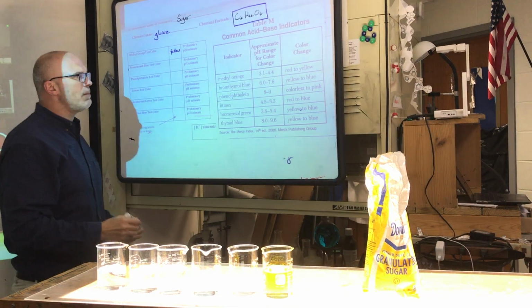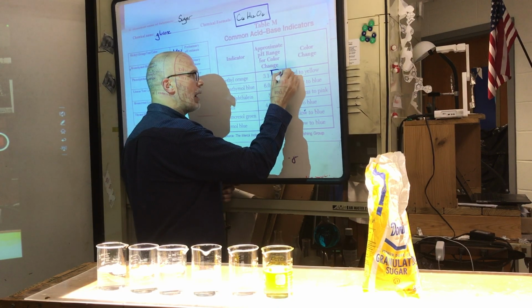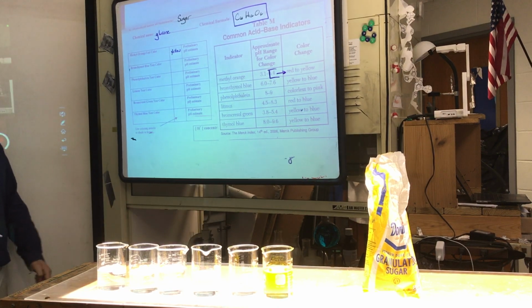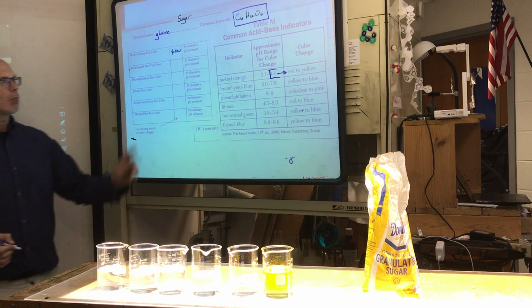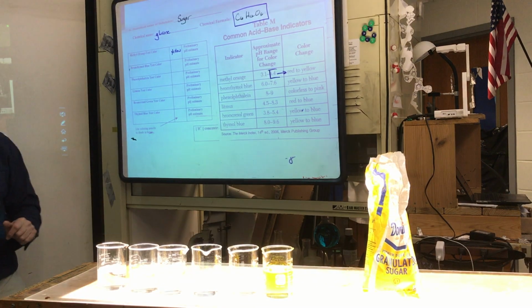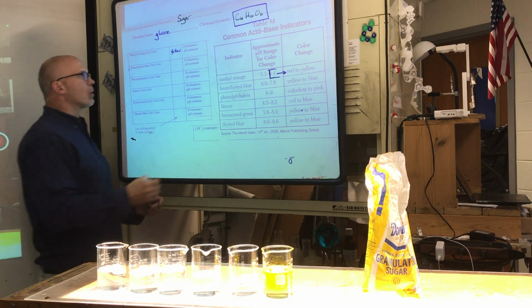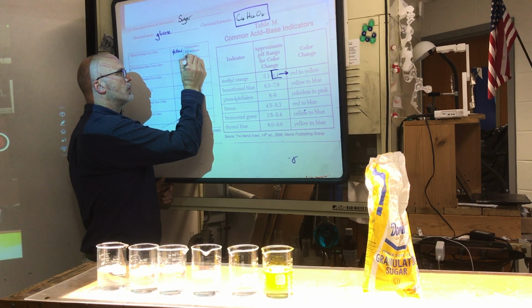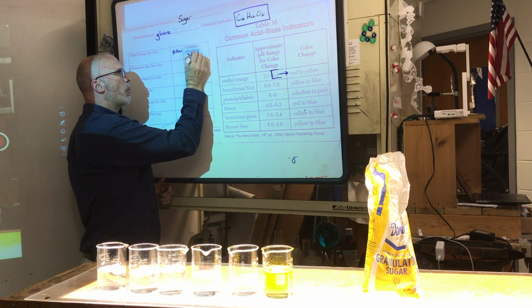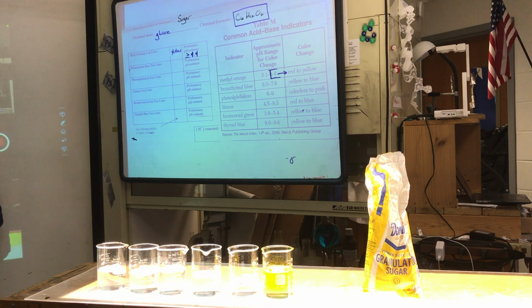Now, what does that tell me? Well, that means it's 4.4 or higher in pH. So what would be our estimate there? If yellow color, when methyl orange, a chemical acid base indicator, above 4.4. Yeah, we'll say greater than or equal to 4.4, because 4.4 is the pH in which methyl orange will turn yellow, so it's greater or equal to.